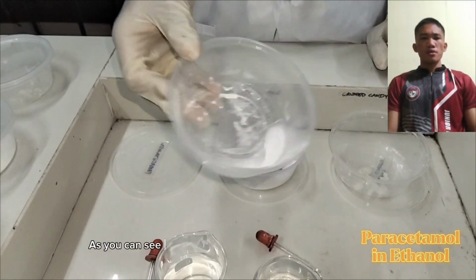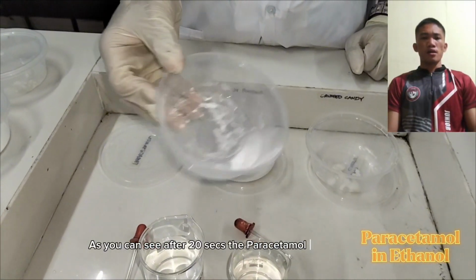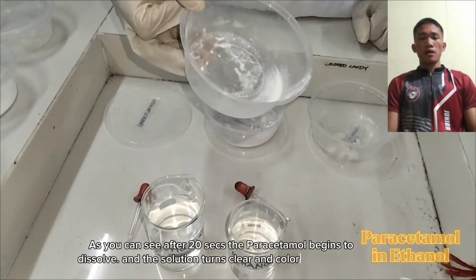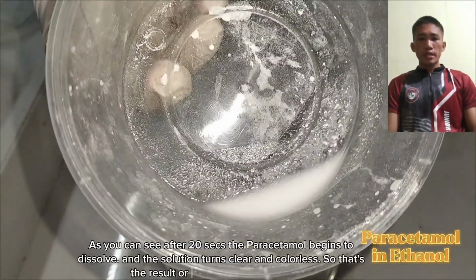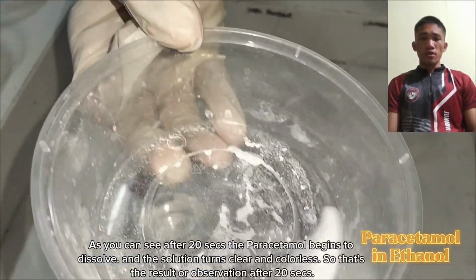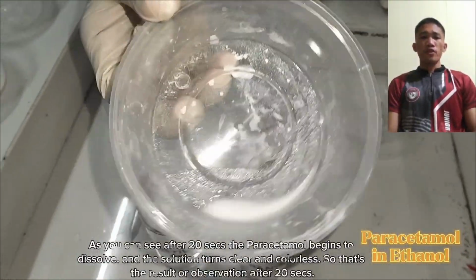As you can see, after 20 seconds, the paracetamol begins to dissolve and the solution turns clear and colorless. So that's the result or observation after 20 seconds.